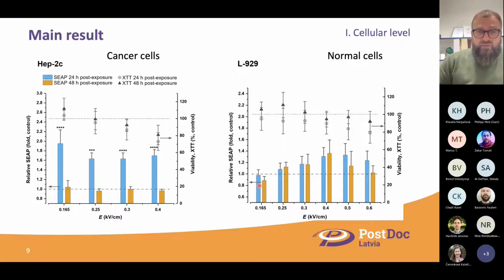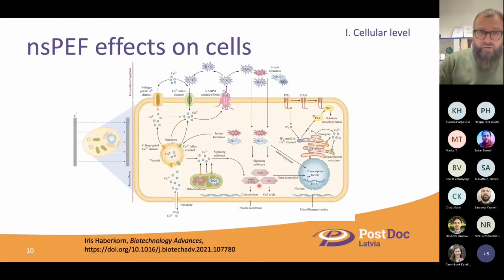And in this investigation, we understood that if you are working with regular, let's say, micro or millisecond pulsed electric field treatment, there are a lot of other factors, and the effects of such pulses are very, very broad. So you will get not only the electroporation as it is, which is quite normal in such protocols.